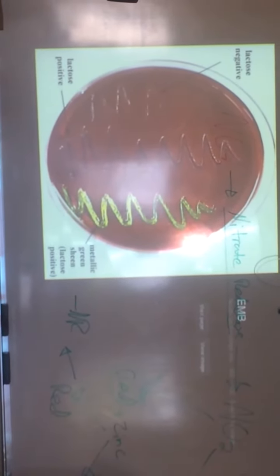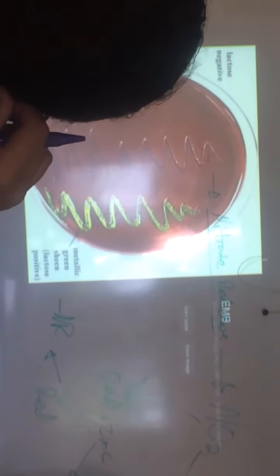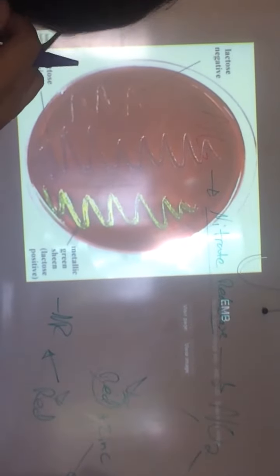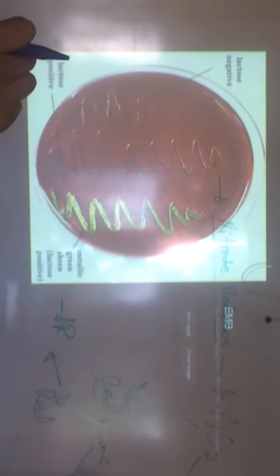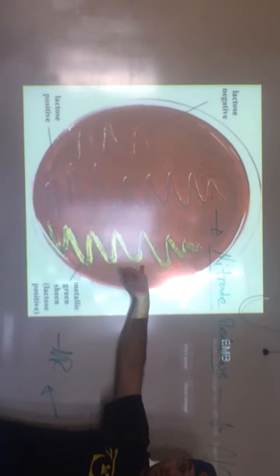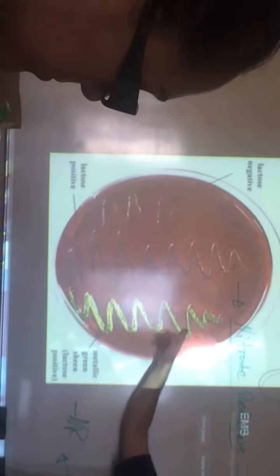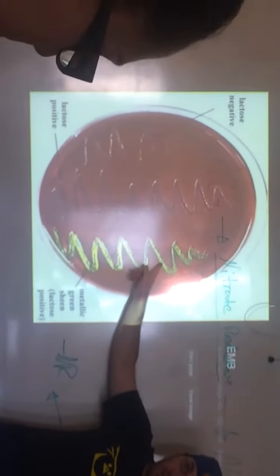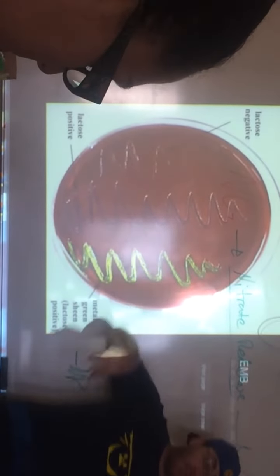Carbohydrates. Yeah. The sucrose and the lactose are what generate the differential. Because the ones that do this fast enough get a green shimmer, they're identified as fecal coliform bacteria. The ones that don't are still gram-negative bacteria, but they're not fecal coliform.